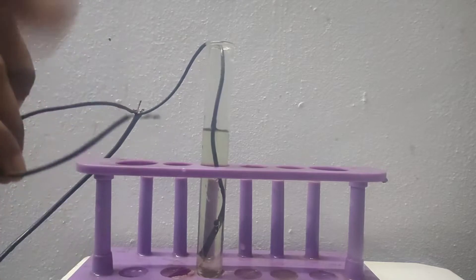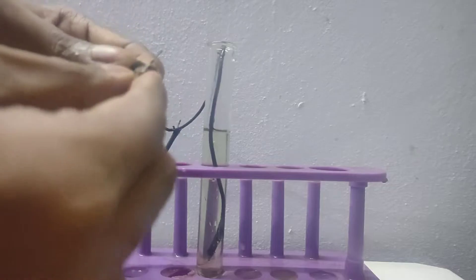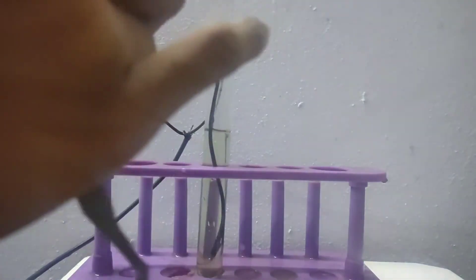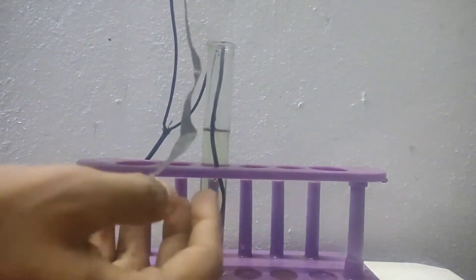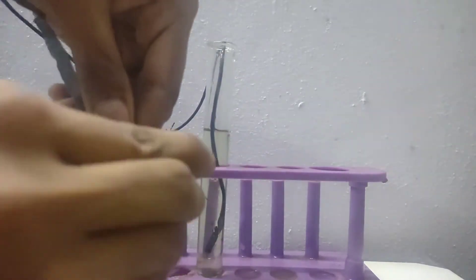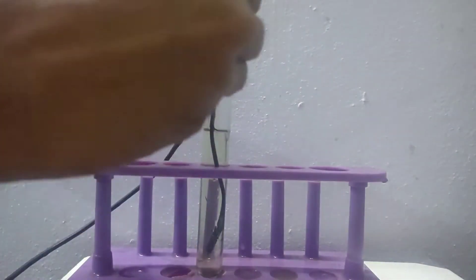Another wire connected to the positive terminal will be connected to the zinc strip. This zinc strip will be dipped slightly above the wire to make our anode. These zinc strips will supply zinc ions into the solution.